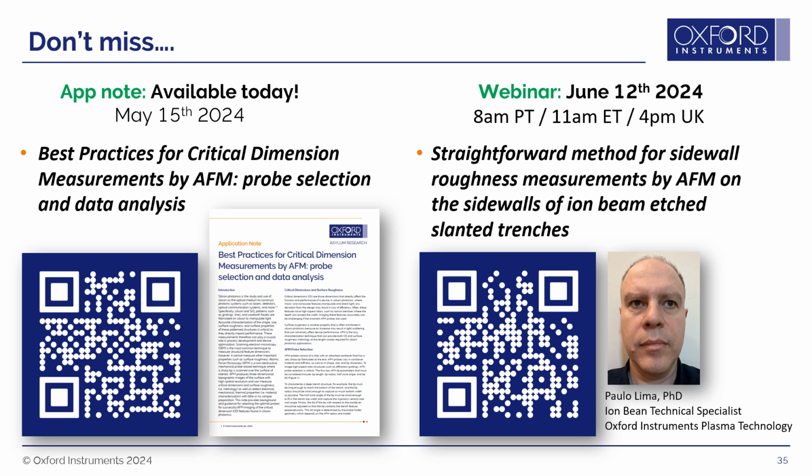Did you use Blue Drive for tapping mode? In some of the images I did, some I did not. It just depended on the image. You should be able to use either Blue Drive or Piezo Drive. The advantage of using Blue Drive is that you have better control of the amplitude, which means you're more gentle on your surface and your tip, because you have better control over the amplitude and the set point for your images.